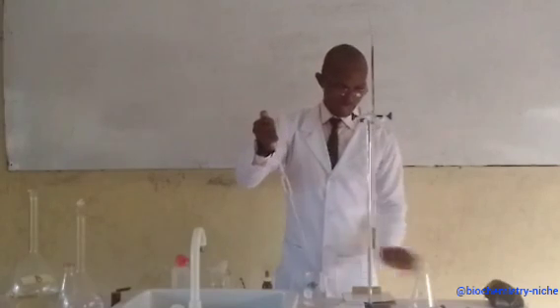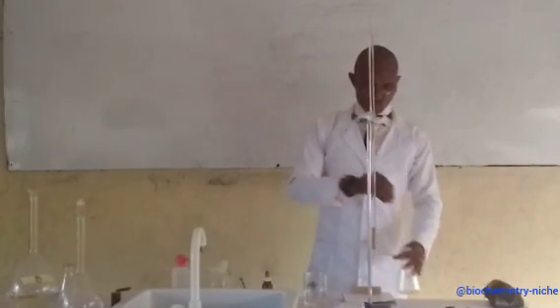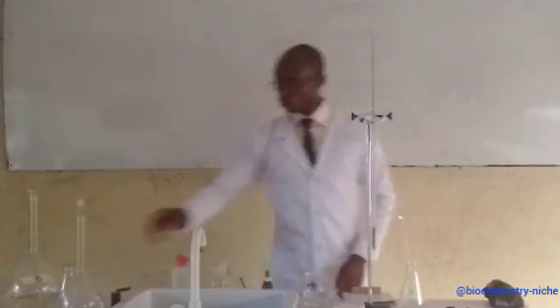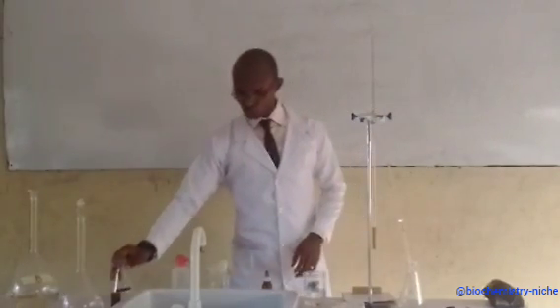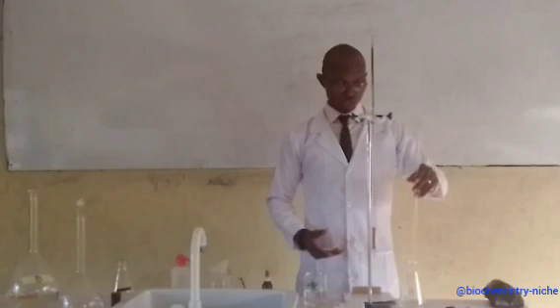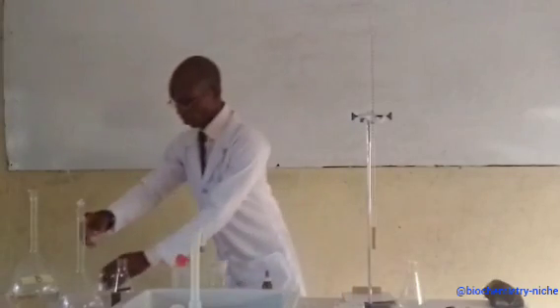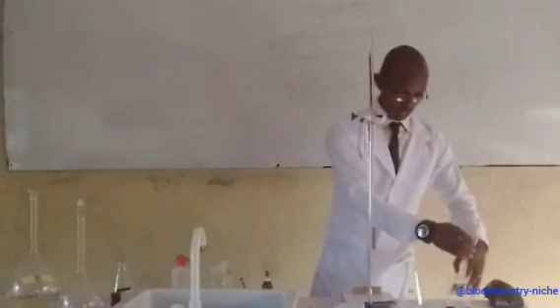Okay, I have the content of my base emptying into the conical flask. So we'll just have a couple of concordant readings. Let's say 2-3 readings, and then we try to see if we can move from there. Here is the way: put the base there, so we don't match them up together.